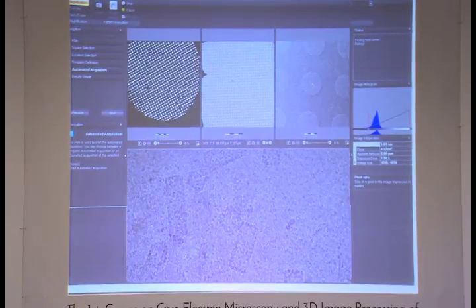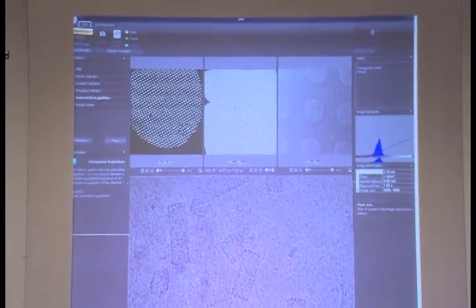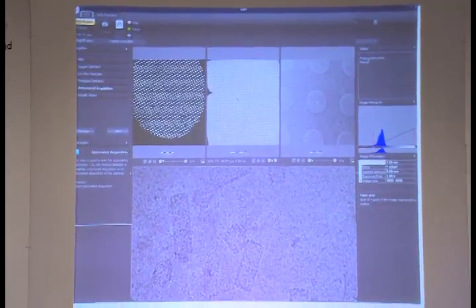When you look at the real raw image on the screen, it's quite a large image, so you won't get that coarsening phenomenon occurring. But generally, if you take images at somewhere between -2 microns defocus and -4 microns defocus, that's a good parameter if you're using something like the Falcon 2 or the Falcon 3 or the K2.